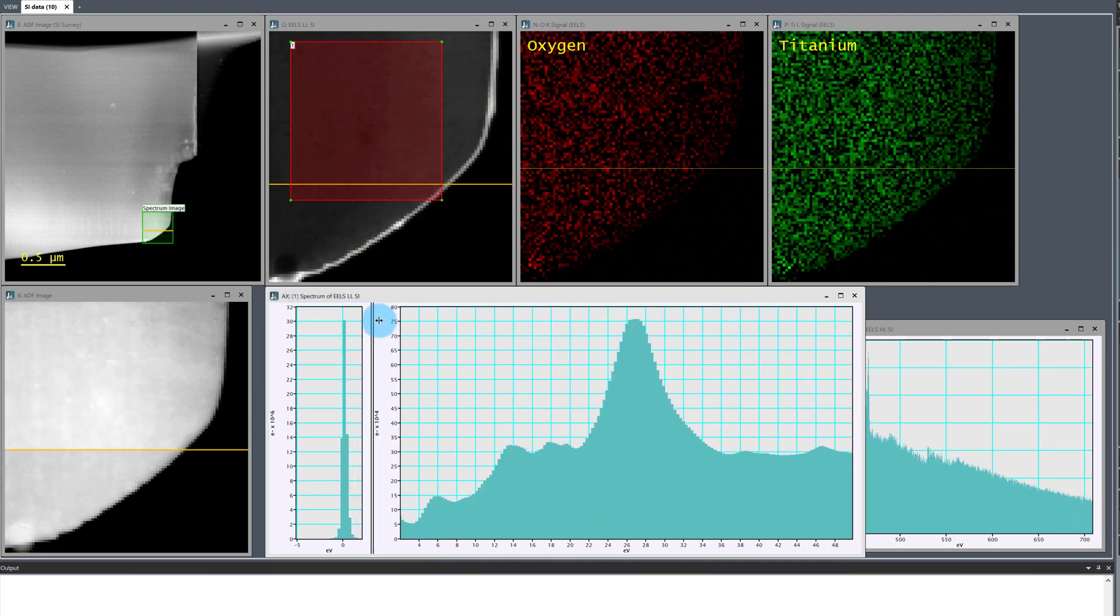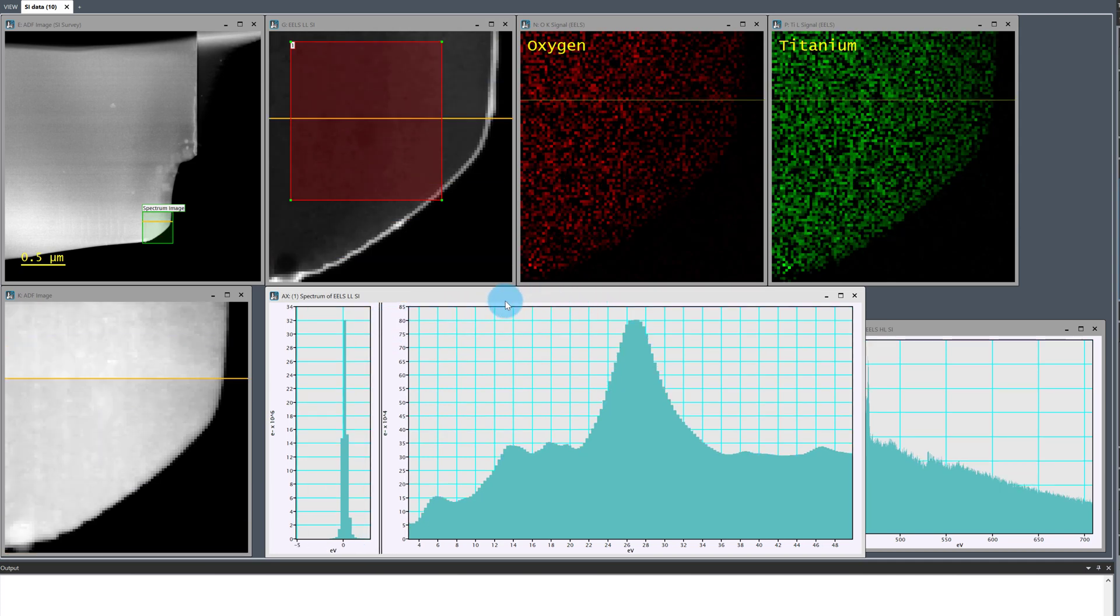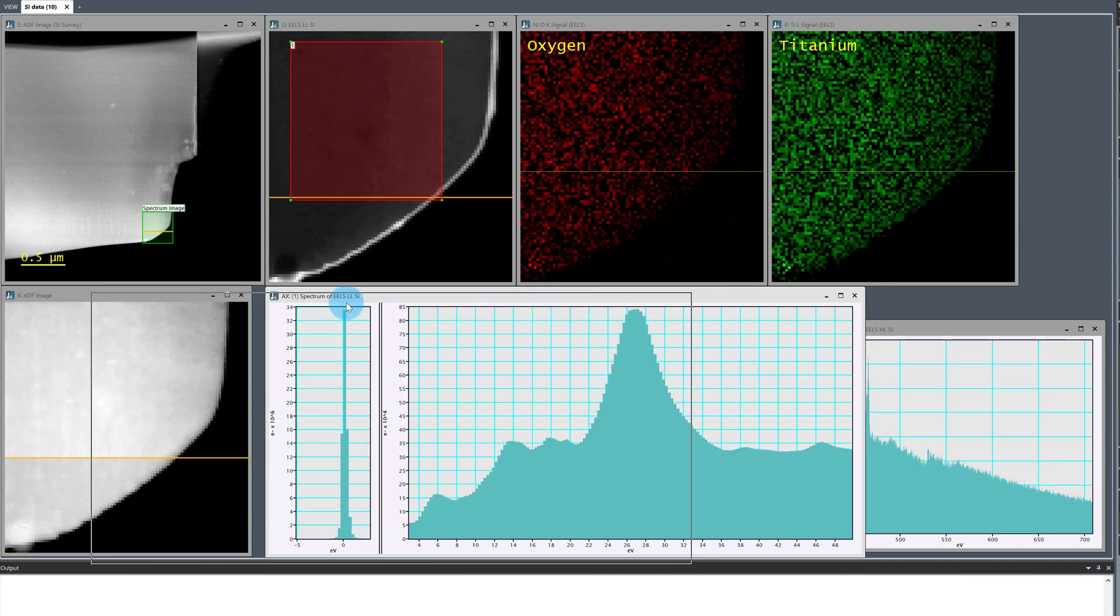I can use the splitter tool so we can see the zero loss peak and low loss features nicely in that low loss spectrum.